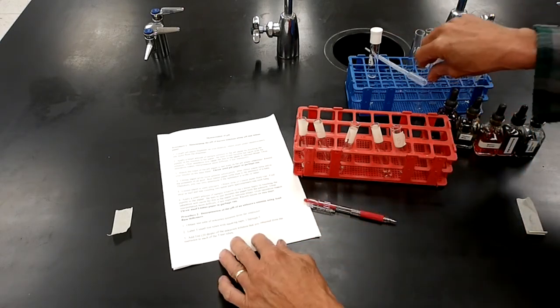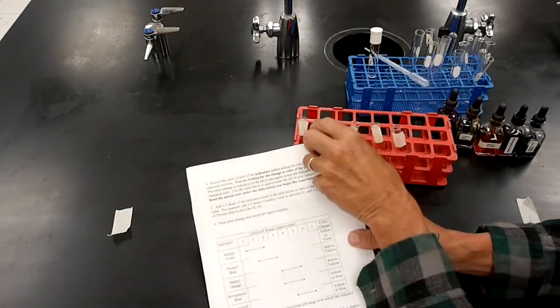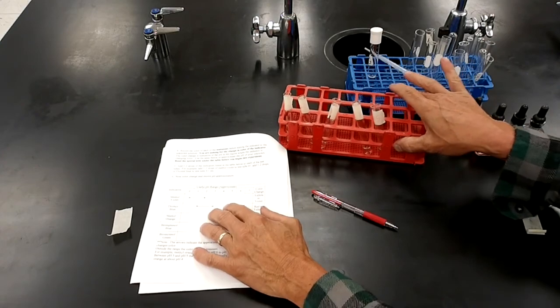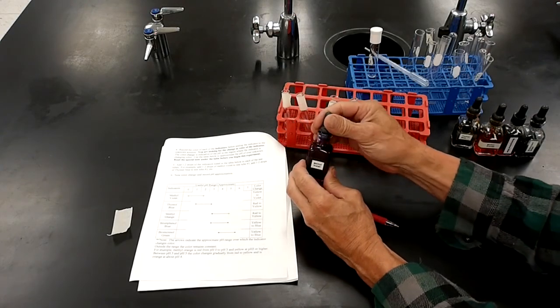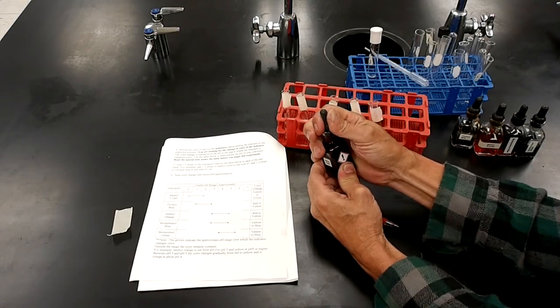All right, now, what we'll do next, I'm going to take a pH indicator. For tube 1, I'm going to use this methyl violet, which is kind of a, as you might guess, a violet color.